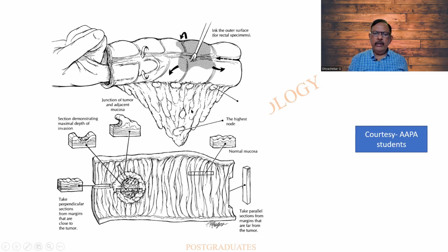Before opening also, I'll be able to find out the lymph nodes. There are different groups of nodes. These are called the paracolic nodes. This is a higher group of node, and this is the apical or the highest. Generally, a surgeon will be tying a knot in this region to help us follow it.